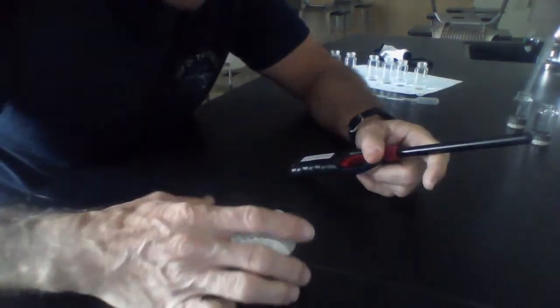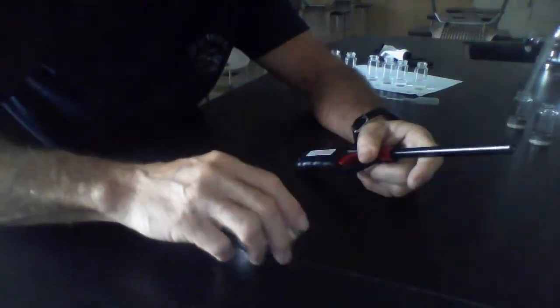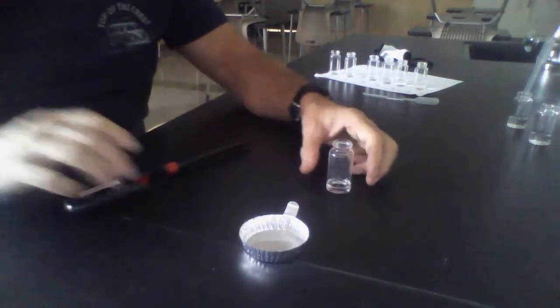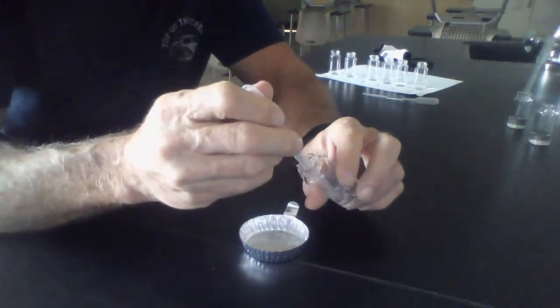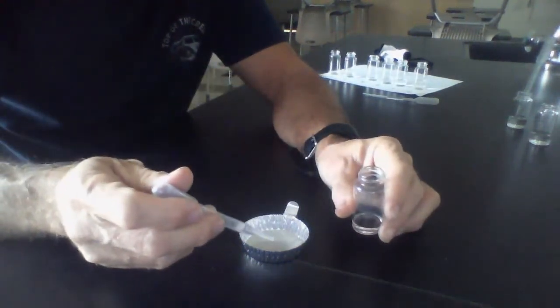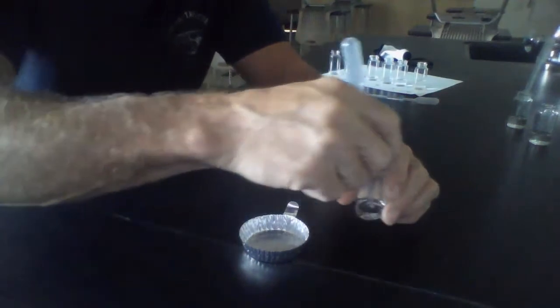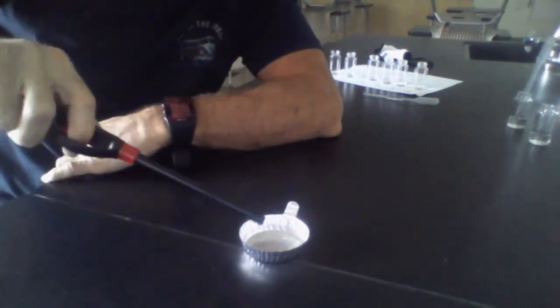You might note whatever you can about color, timing, things like that, because you need to identify it. It's now time for N-propanol. And we are staying safe, getting a clean pipette, and we're going to do our 5 drops. 1, 2, 3, 4, 5. The accuracy of this isn't perfect, you know. I'm accurate to within a drop, but occasionally it might not be exactly 5. 3, 2, 1, go.